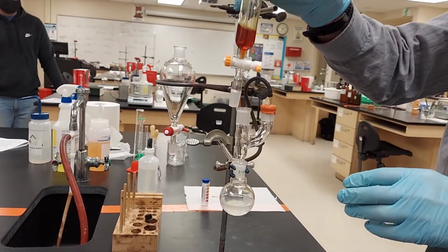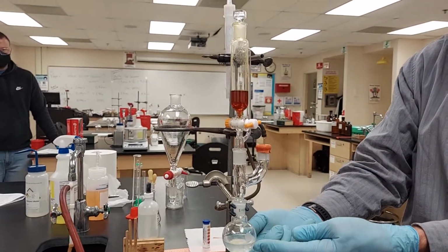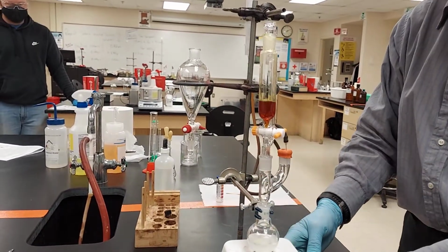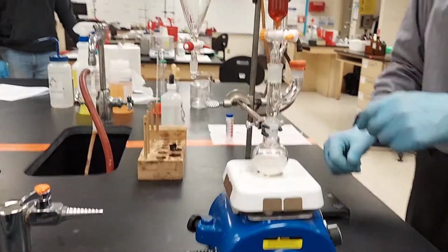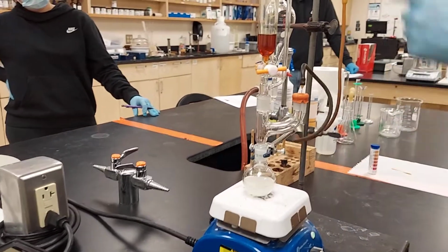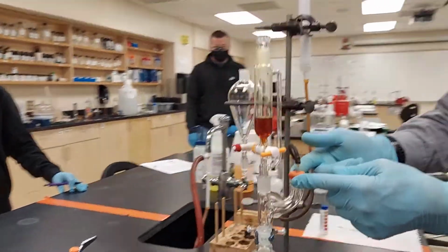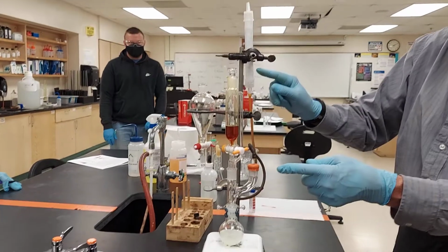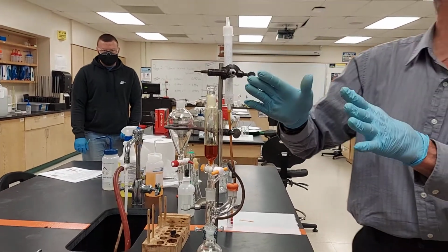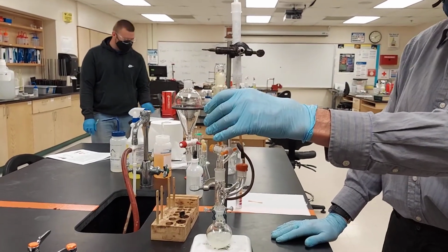So we have a pretty interesting setup. We have a 50 ml round bottom flask with a magnetic spinner, and it's spinning. We have a Claisen head equipped with a drying tube that has calcium sulfate in it. There's a septum here with this needle connected to our drying tube. So now our system, it's still open here, but it's definitely dry. There's drying agent in here, and we're ready to add this when we need to.